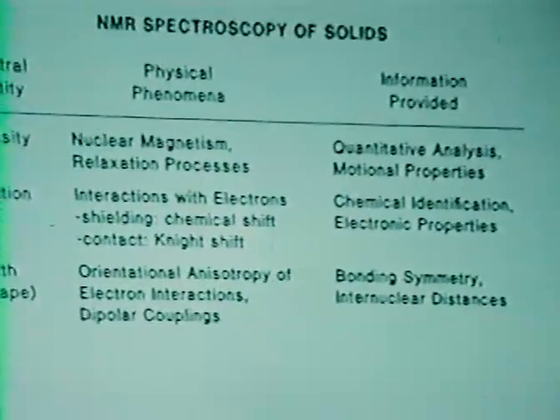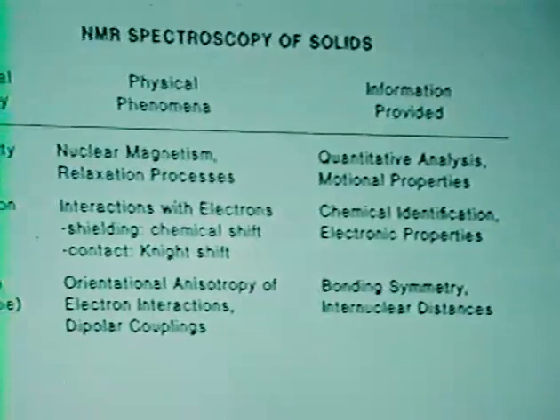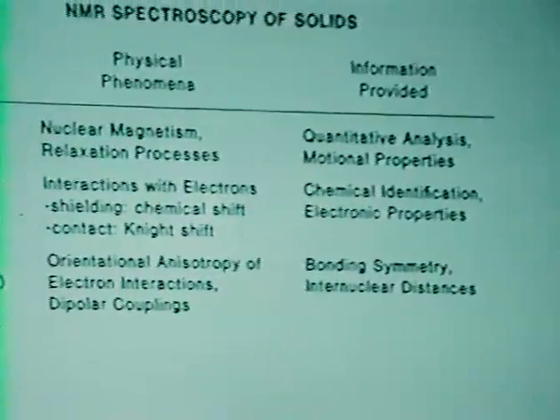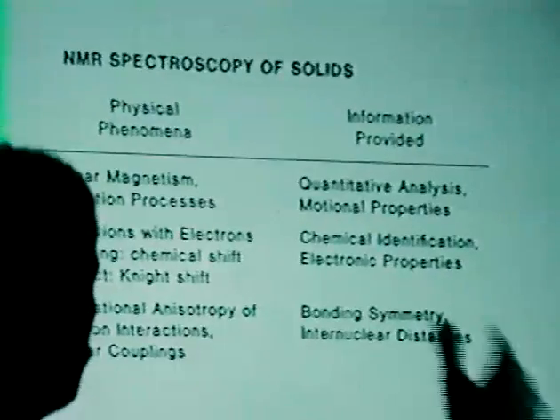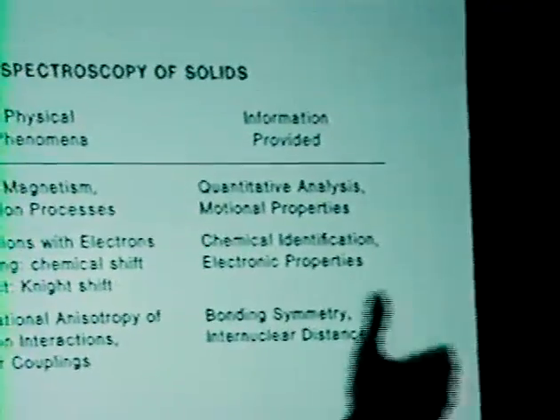As most of you are familiar from studies in carbon-13 or proton NMR of organic liquids, the position of a line, that is the shift of the line, is typically determined by interactions with electrons. The most common being the chemical shift, that is, bonding electrons have this induced angular orbital momentum that is going to shift the line from some known standard, for example, TMS.